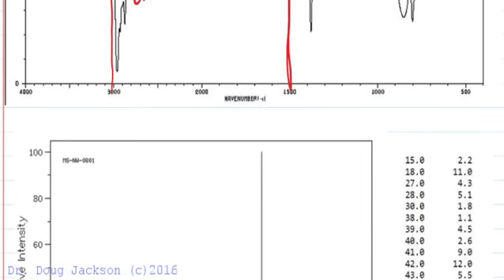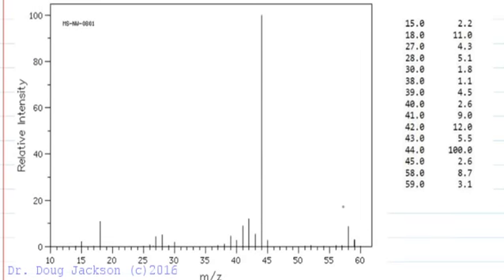If we didn't know that, we would be left at a disadvantage trying to pick the molecular ion between 59 and 58. And so because we know the nitrogen rule says that an odd number of nitrogens in a compound yields an odd numbered molecular ion, this is M+. The other way we could figure that out is we could say, okay, so 58 and 59.